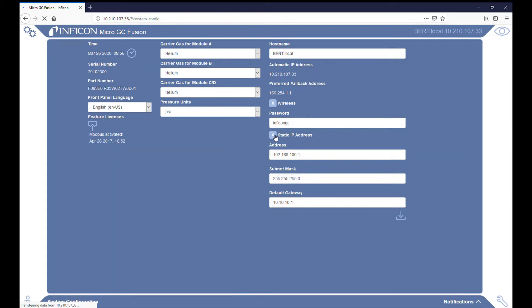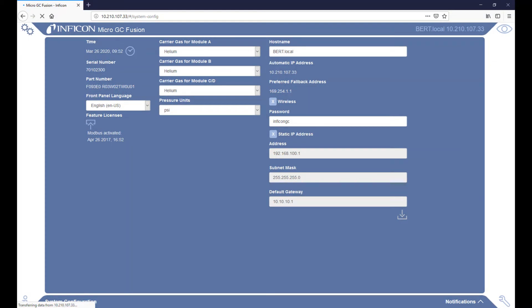Consult with your IT department to acquire an IP address that is not in use on your company's network. Type this IP address in the Address field. Click the Save icon. When changing from a DHCP to a static IP address, reboot both the computer and MicroGC Fusion. After MicroGC Fusion reboots, simply type the new IP address into the web browser's address bar.